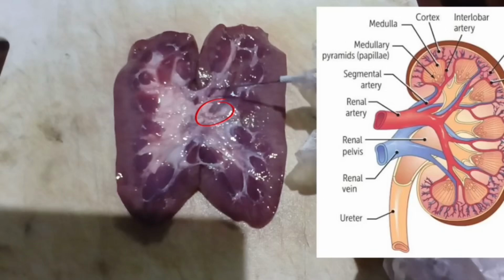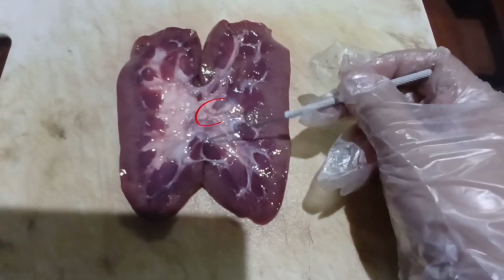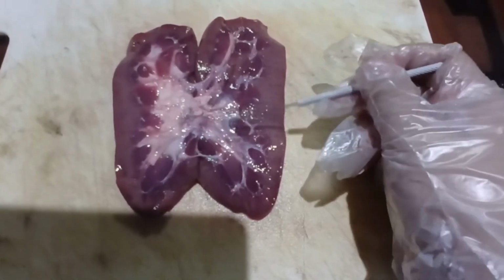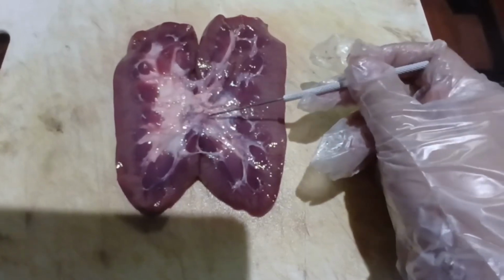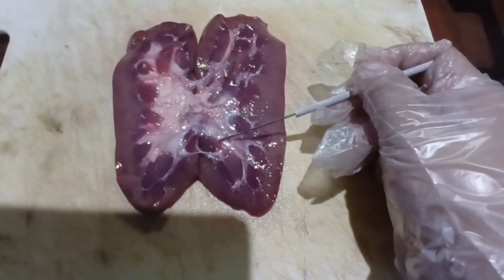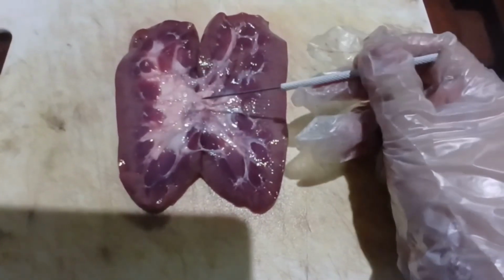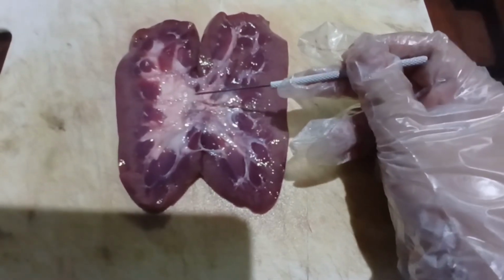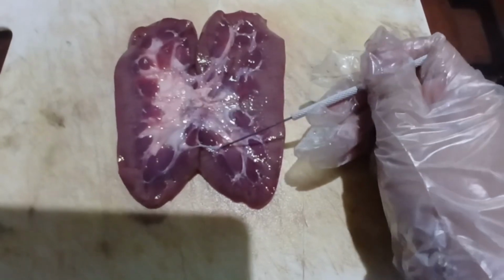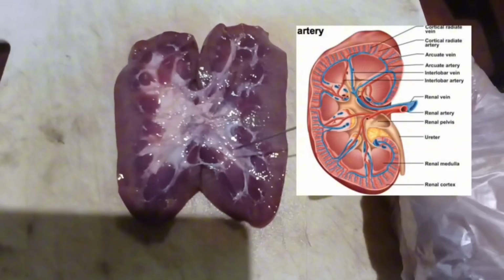Then we have the segmental artery. The renal artery splits into the segmental arteries. These supply the different parts of the kidney, or the segments, as we call them. This branching allows the blood distribution to the different areas of the kidney. Next, we have the interlobar artery.